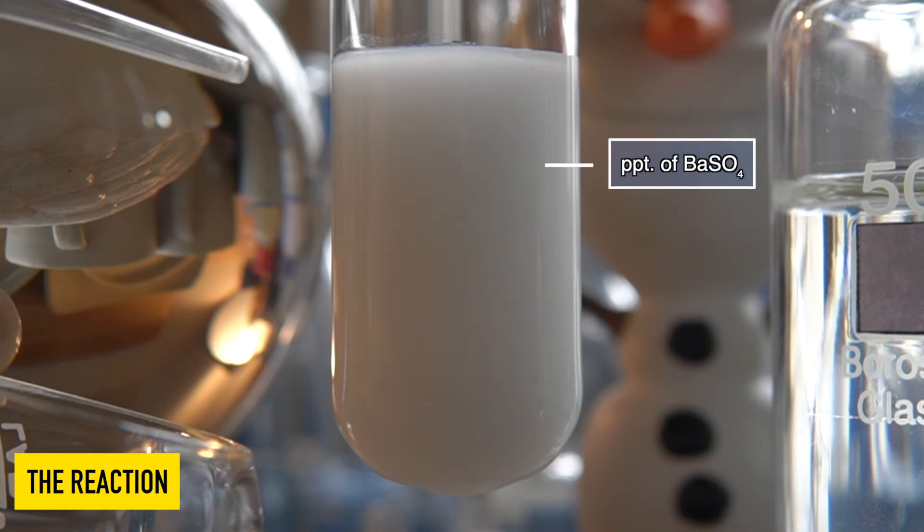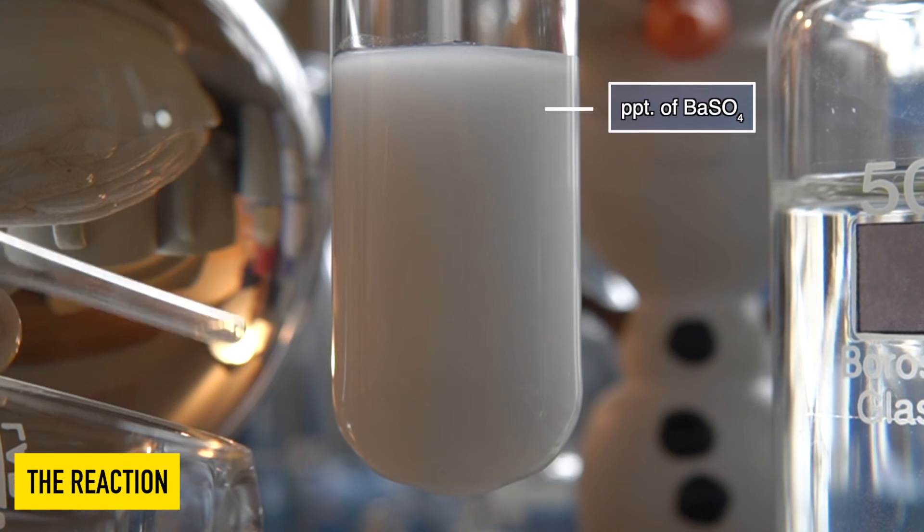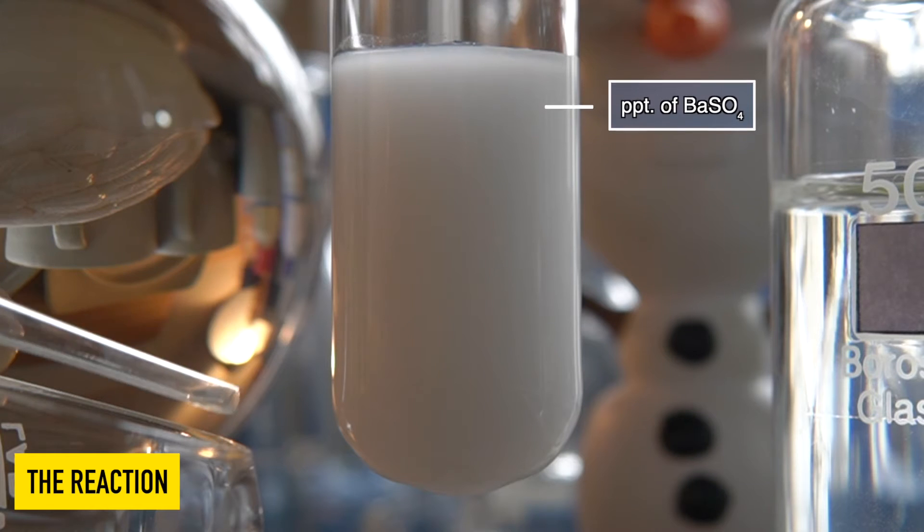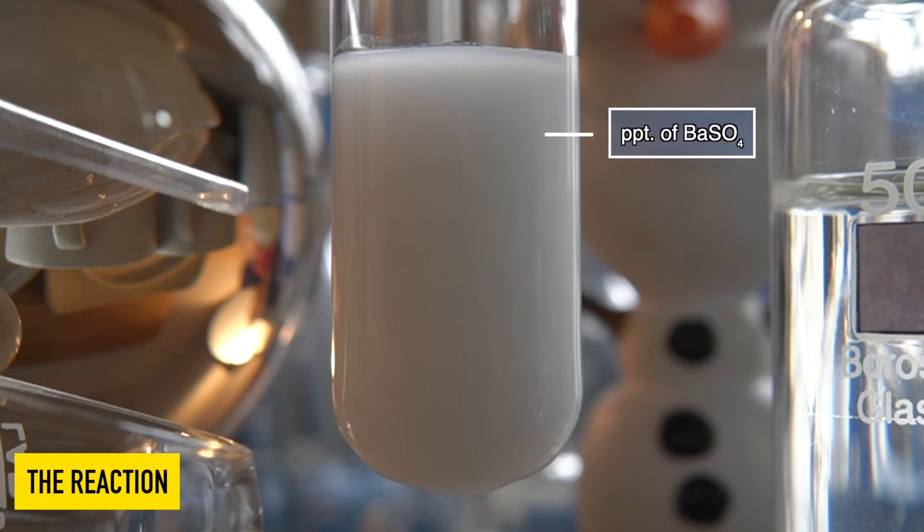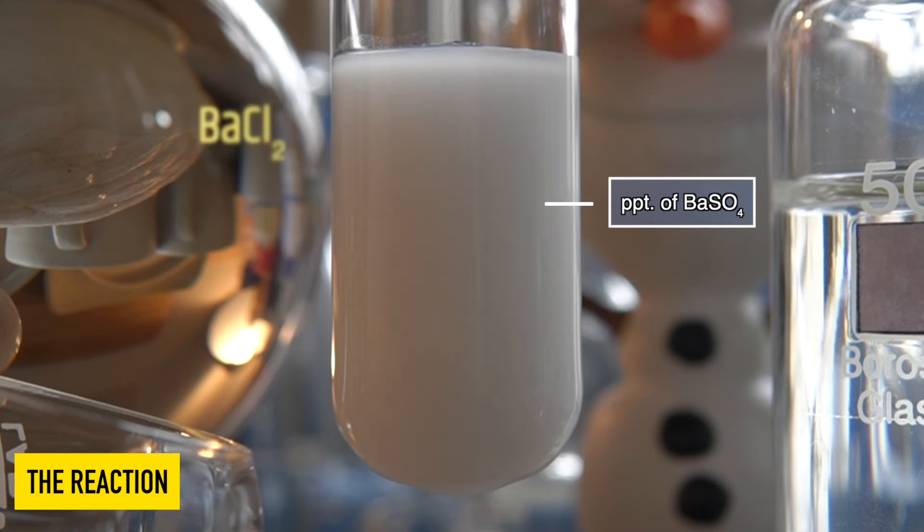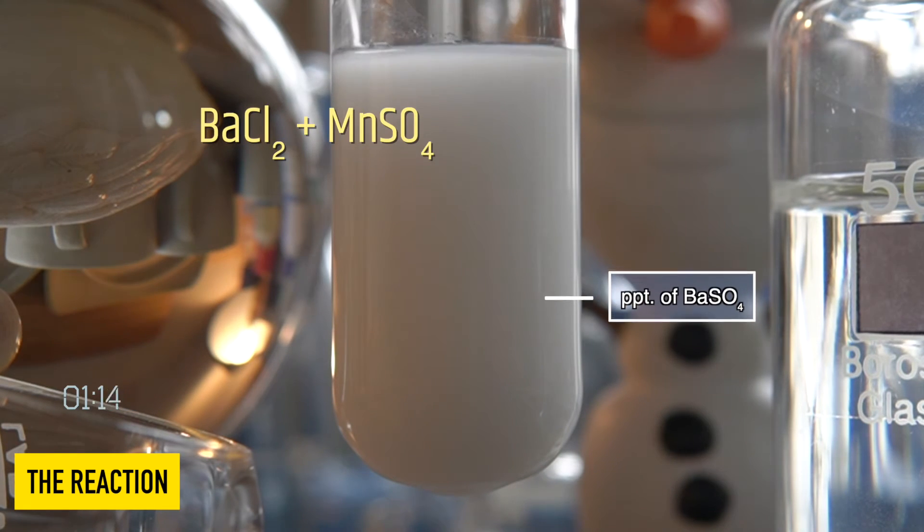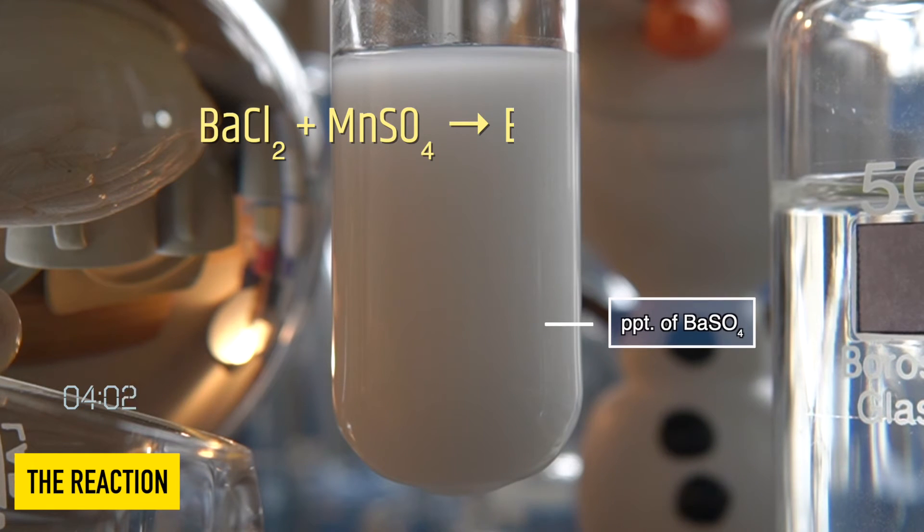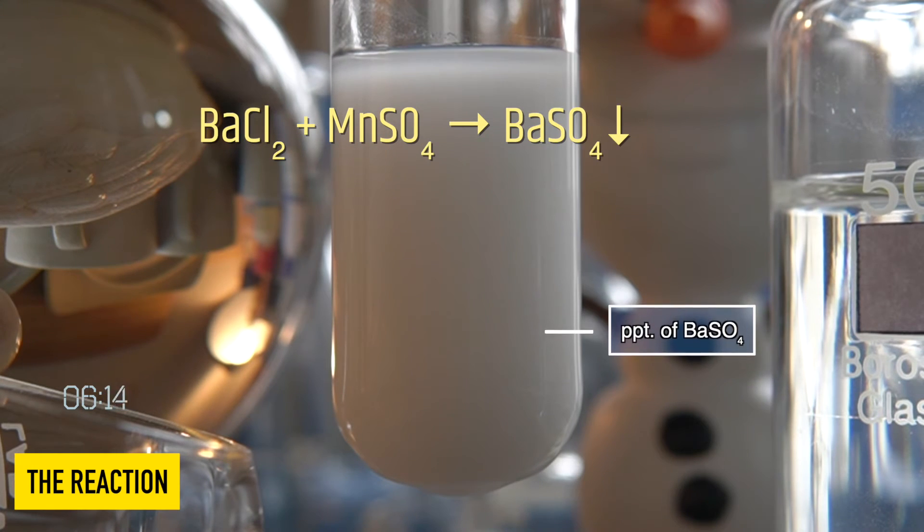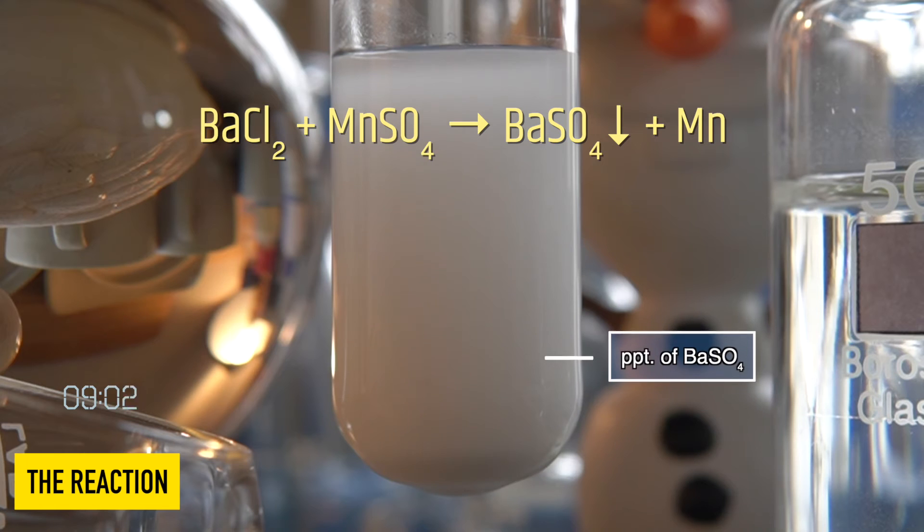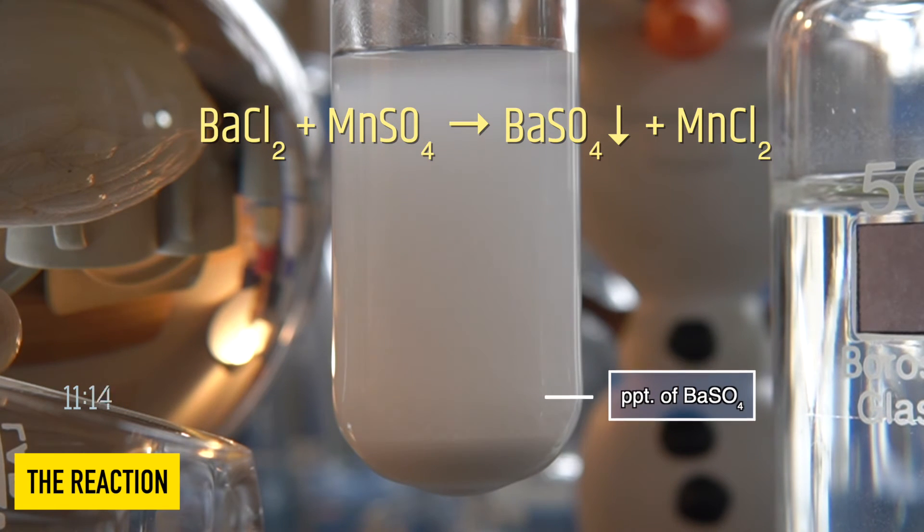The insoluble milky white precipitate that has been formed inside the test tube is nothing but barium sulfate. In this reaction, barium chloride reacts with manganese sulfate to produce an insoluble precipitate of barium sulfate along with manganese chloride.